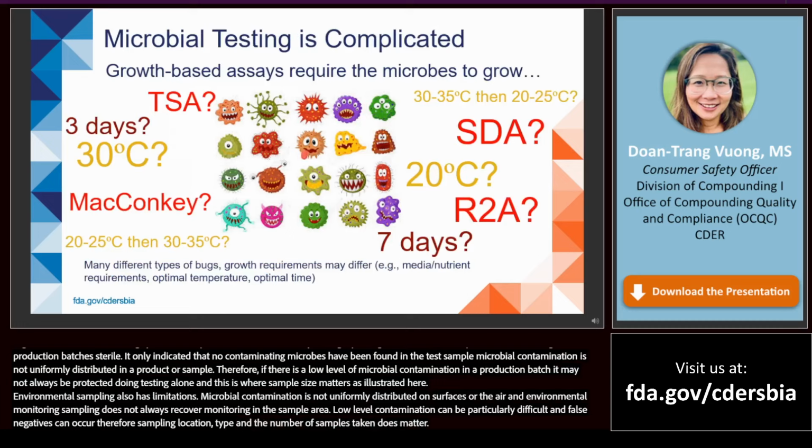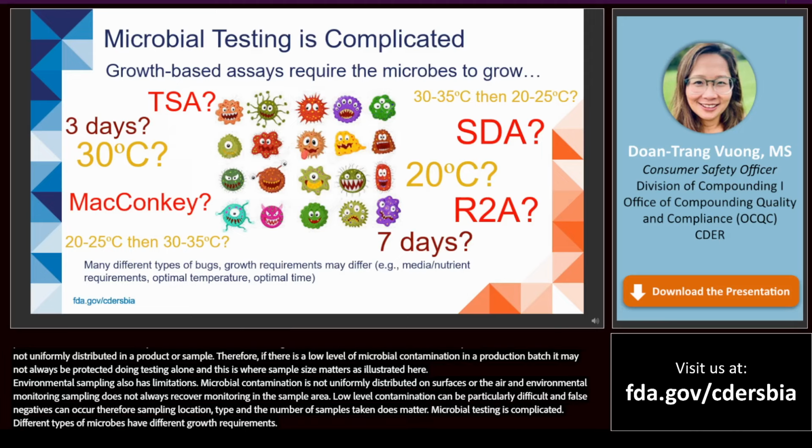Microbial testing is complicated. Different types of microbes have different growth requirements, differ in media or nutrient requirements, as well as temperature and incubation time parameters.